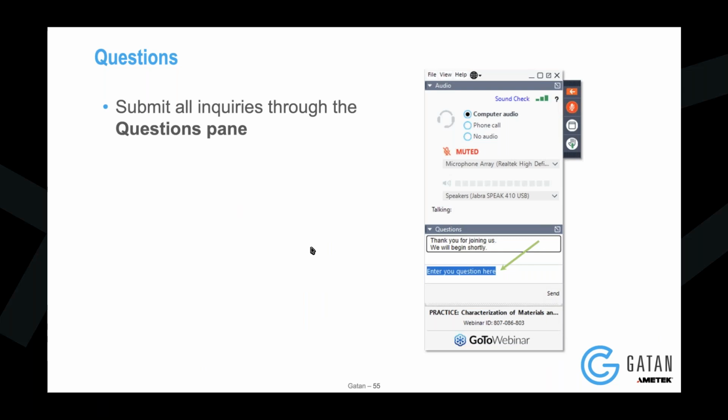We can see that in certain scan directions, the domain wall itself clicks back. And so we're probably missing a movement. And we could see this before as well when we had a different camera, an older one, our K2. We would see that from line to line it would change the location instead of a continuous path, and you could see this kind of scan distortion. So certainly this is what we're trying to heavily work on. I think with the scan patterns, we can do so many things, but it's really the speed of our acquisition that's the only thing limiting us now.